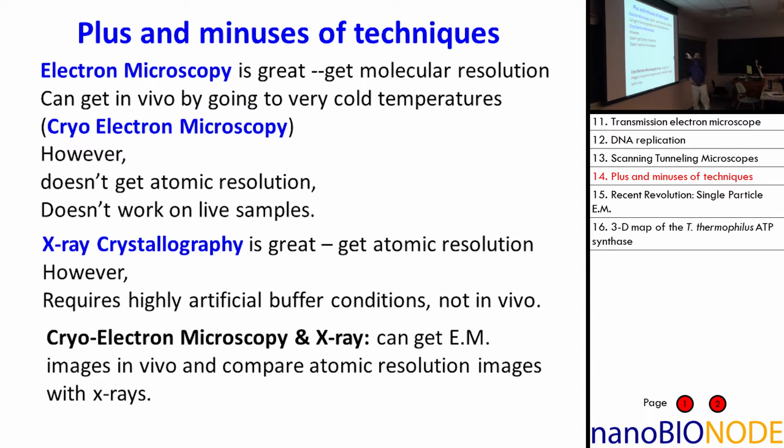Okay, so that's called the cryo-electron microscope. However, even then, you don't get atomic resolution, and for sure, it doesn't work on live samples.